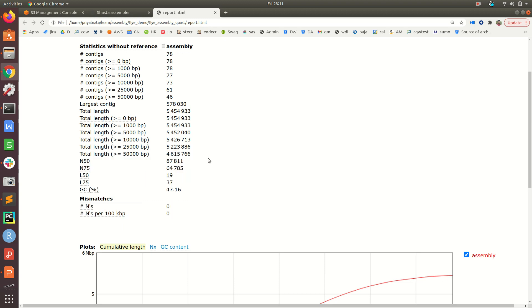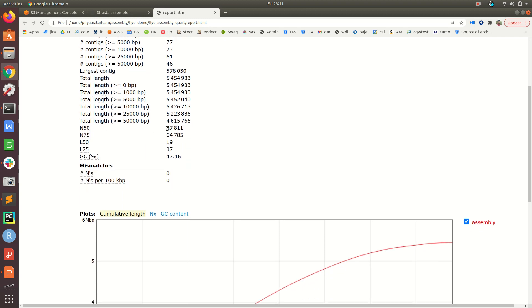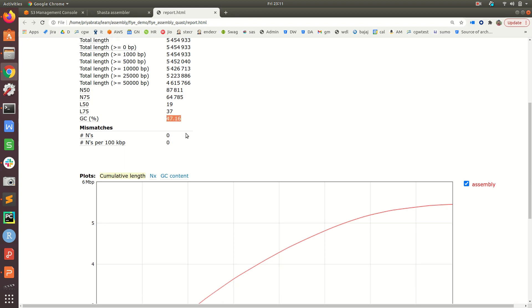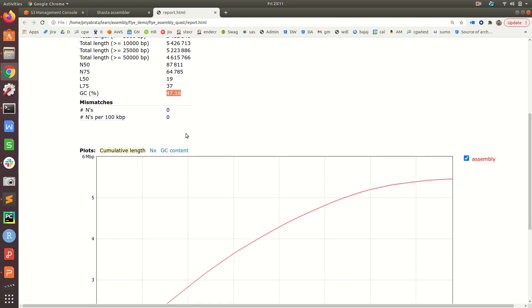It gives an N50 value of 87,811. Any contigs longer than this, if we add them up, will form 50 percent of the genome size. Similarly, N75 value is around 64,378, and L50, L75 values are also there. The percentage GC content of this assembly is around 47.16 percent.